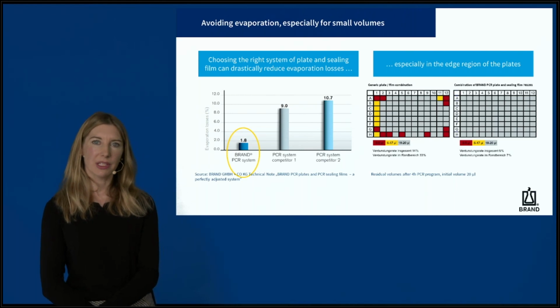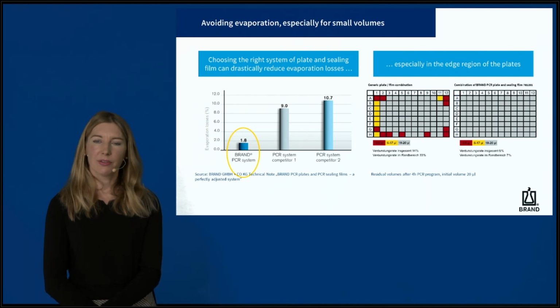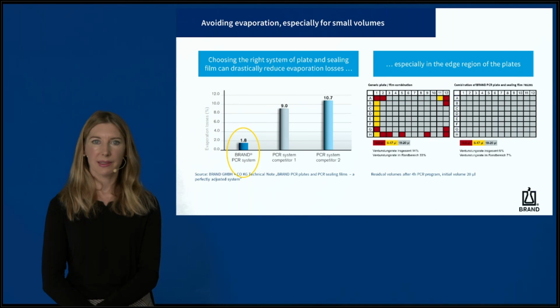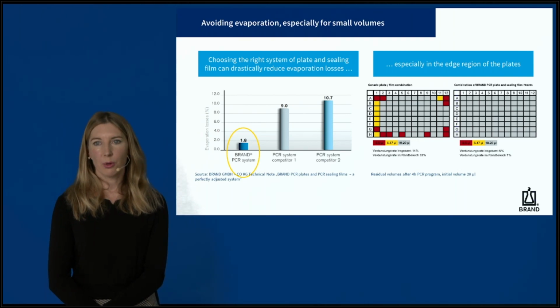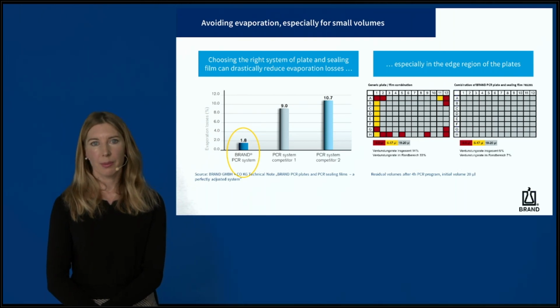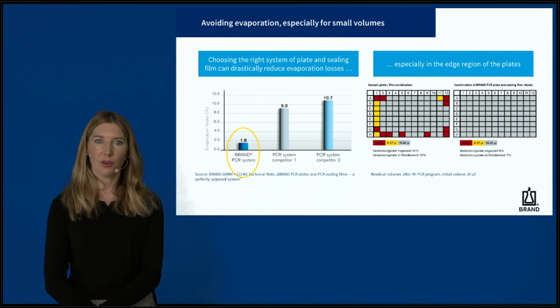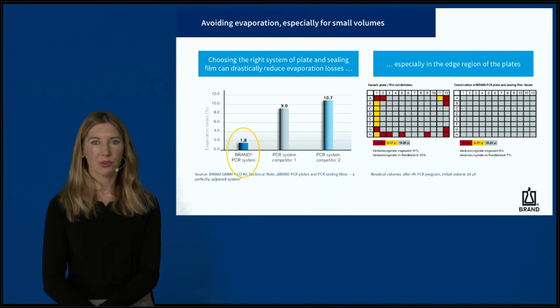Especially in the edge regions of the plates, in the red marked fields, the evaporation loss is up to 33%. This study also illustrates how important it is that the combination of the PCR plate and sealing film are a compatible system. And moreover, an optimal lid pressure of the thermocycler is required. Furthermore, when using PCR tubes, please inform yourself how many tubes must be used at minimum, because too few tubes might be damaged by the lid of the thermocycler as the pressure might be too strong.